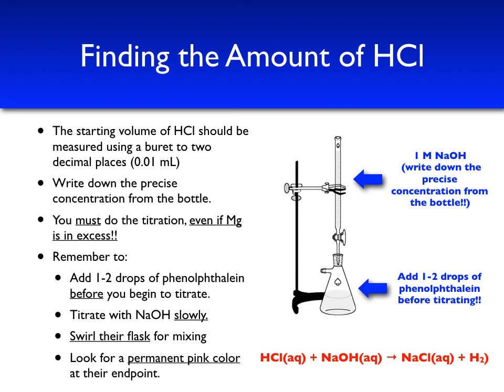You'll see in our experiment that once we know the moles before and after the reaction takes place for all of our products and reactants, we can put them together in what's called an ICE table, or ICF table, I guess in our case, where we track the initial, final, and change in moles. Therefore, then we can compare different amounts to determine which ratios match the coefficients in the chemical reaction best.